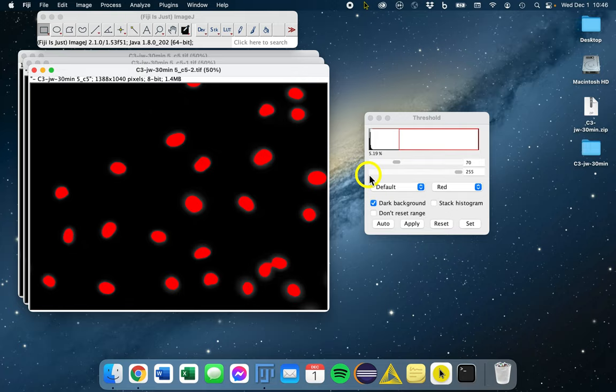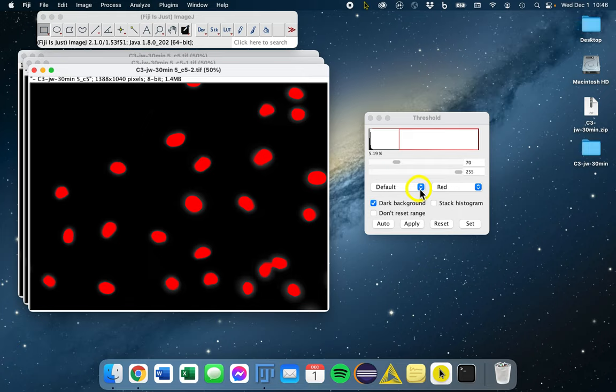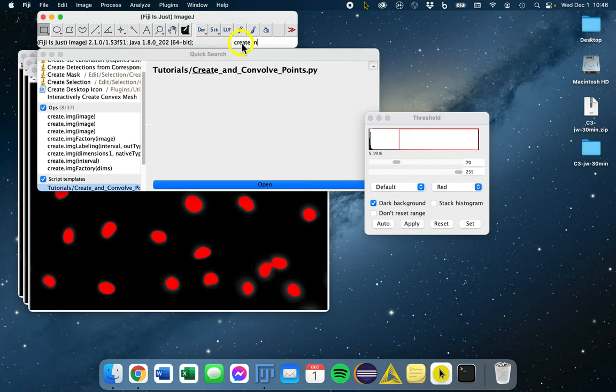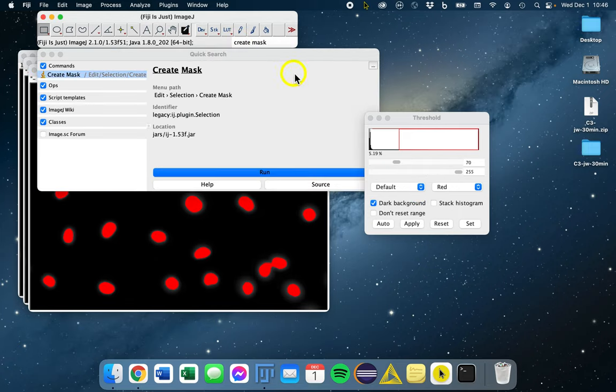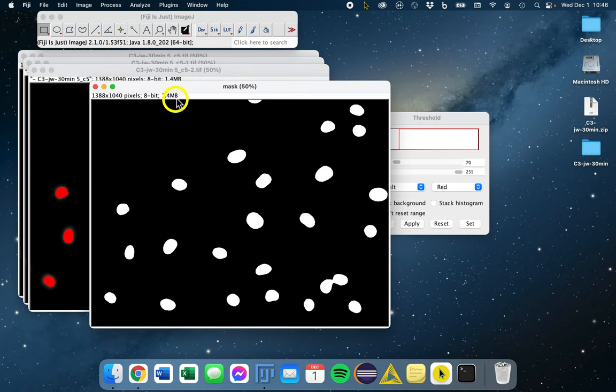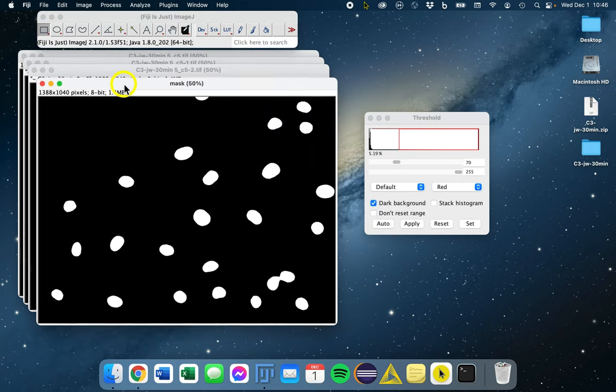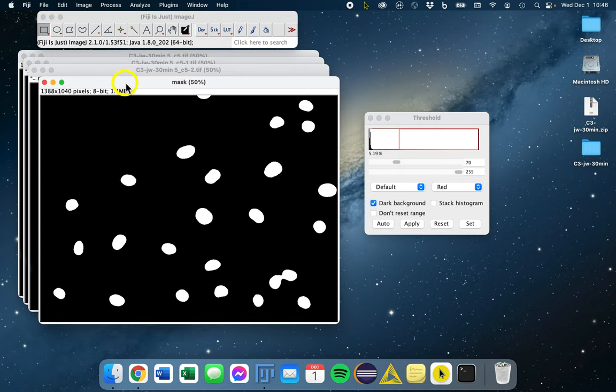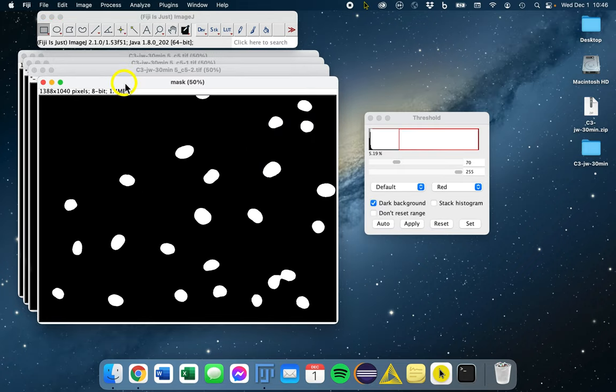So once we find a threshold we're happy with, and in our case we're going to use the default method, which again is based on OTSU, we're going to go ahead and create a mask. In the search bar, just type create mask, run that, and now we have our binary image for the next step.